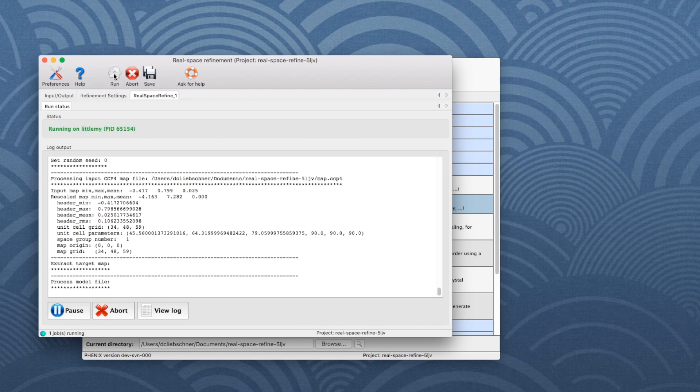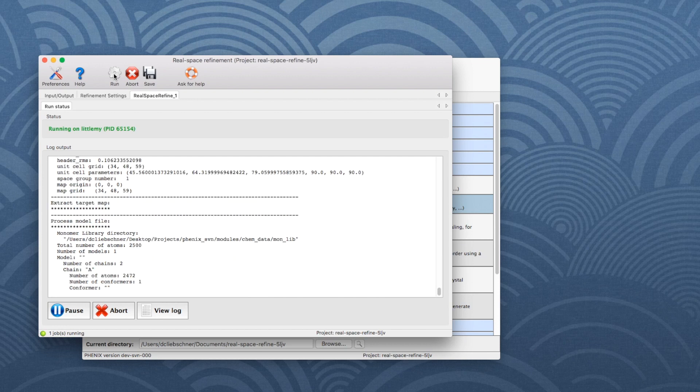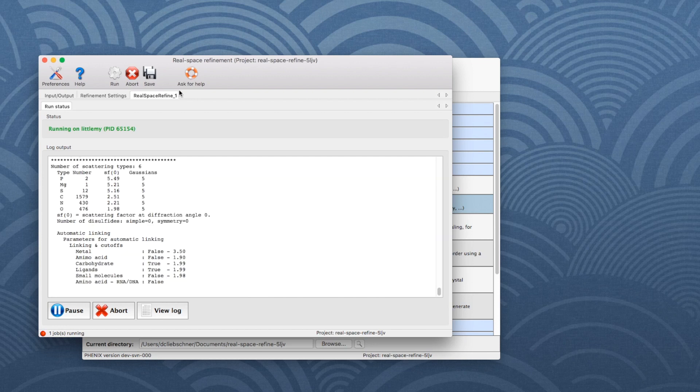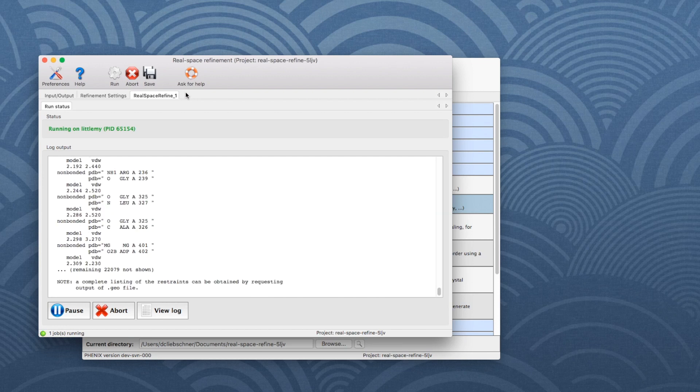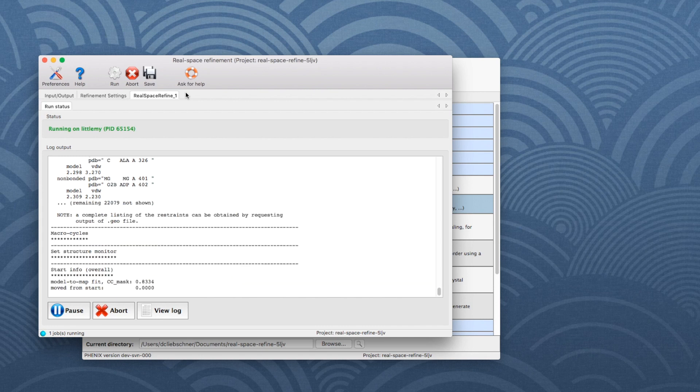After starting the refinement job, the Run Status tab shows the refinement log file, which is updated while the task is running.